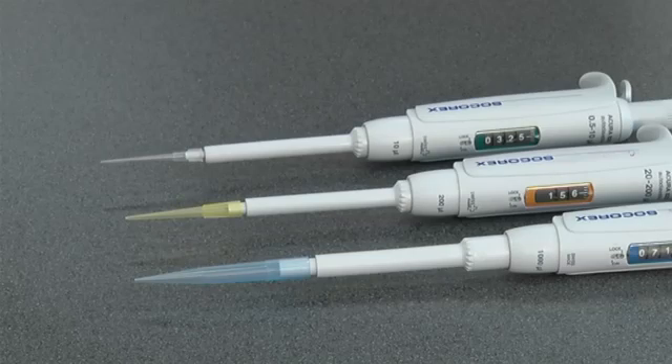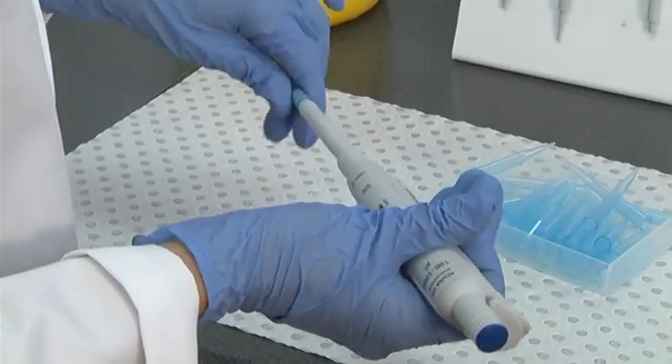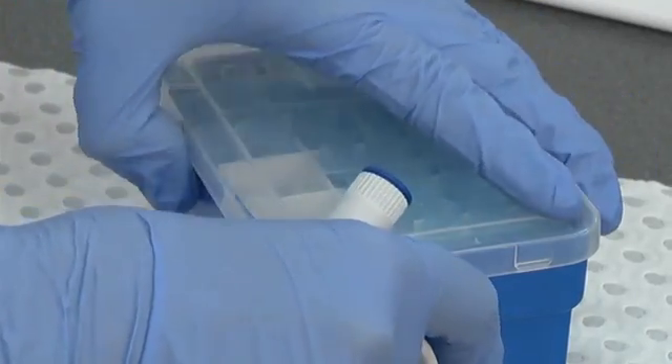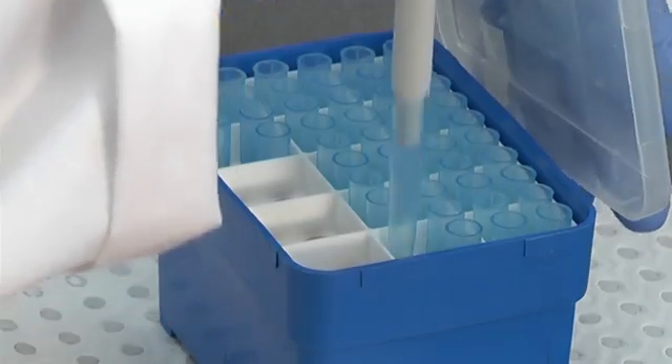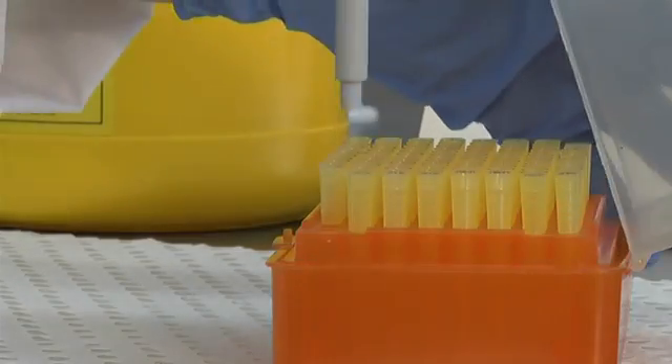When using the pipette, first a disposable tip is placed on the end. Different tips are used for the different size pipettes. The 1000 microliters pipette takes the larger blue tip, the 100 microliters takes a yellow tip, and the 10 microliters takes a small clear tip. Tips can be placed on the end either by hand or by using a tip rack. Either way, it is important to ensure that the tip makes an airtight seal when placed on the end.